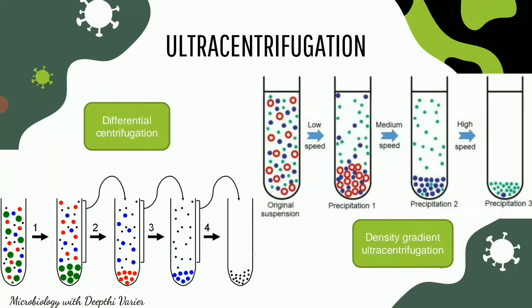sedimentation. Now, how this can be done is by applying very high speeds, spinning the sample at speeds of 10,000 rpm, 40,000 rpm as well. Here rpm means rotations per minute. Currently we have ultracentrifuges which can spin as much as 150,000 rotations per minute, or 150,000 rpm. In 1 minute, it spins 150,000 times. Now, how does this help?